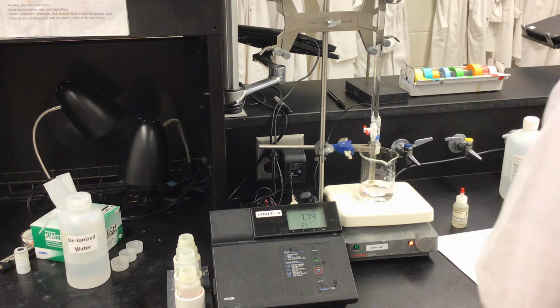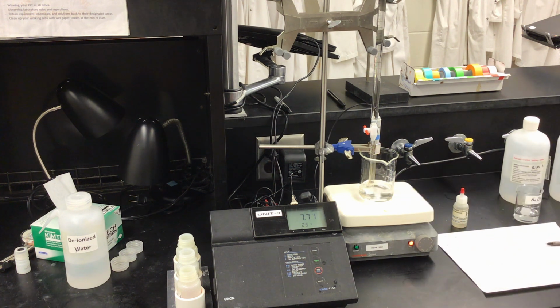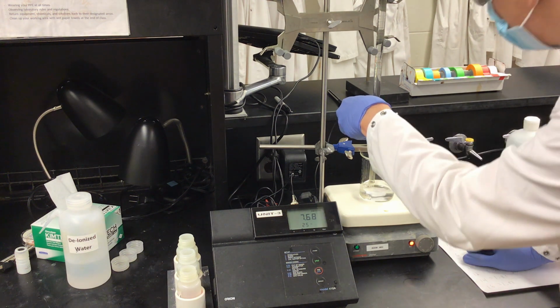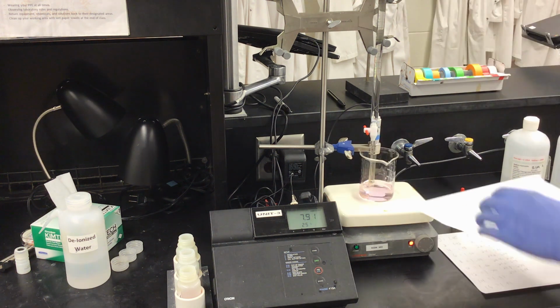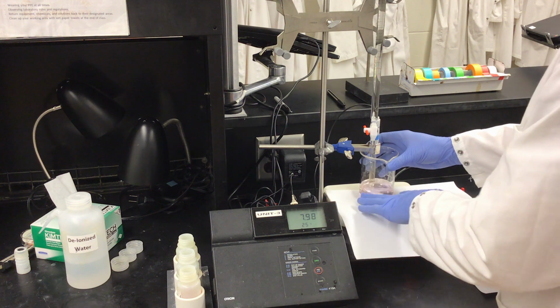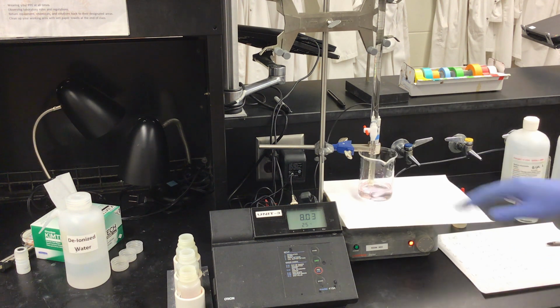And now looking at my solution, I can see that there is a slight pink in it still. However, it is now mixed and gone away. So that means I am very close to my endpoint, since it is taking several seconds for the pink color to fade. So in order to help visualize this, I'm going to place a white sheet of paper underneath my beaker. This will help me see the pink solution, since there is more of a contrast.